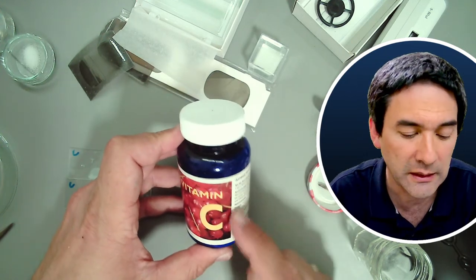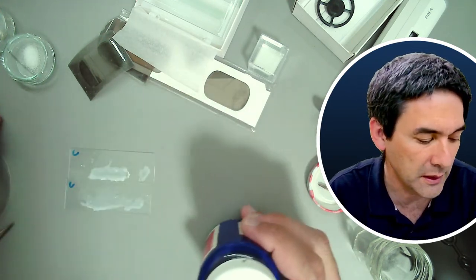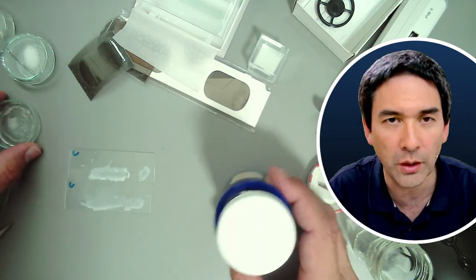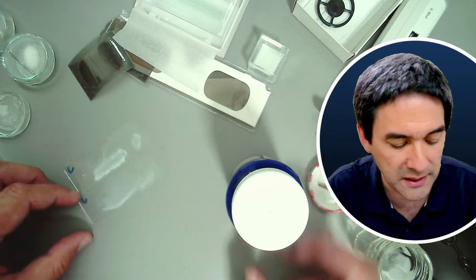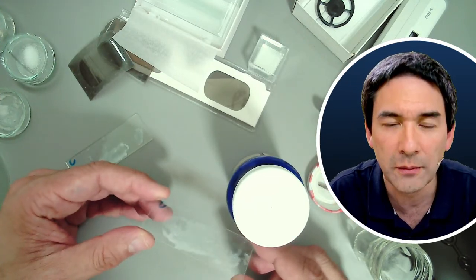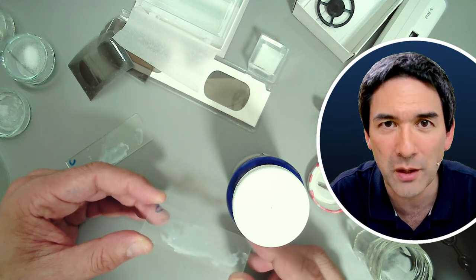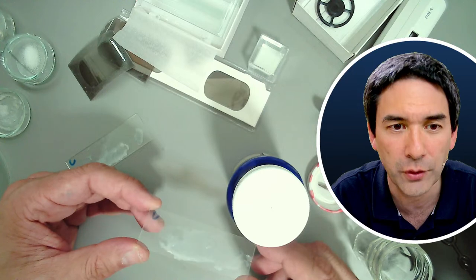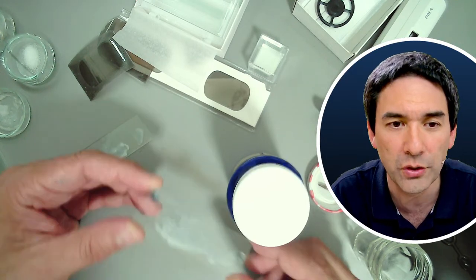What I've done is I've taken a little bit of this vitamin C powder, and I basically put it into a little bit of water, and then I placed the water on the microscope slide and I allowed it to dry. Now, because it's a little bit moist and humid where I'm living right now, it took quite a bit of time for it to dry. So I've done this essentially for you.